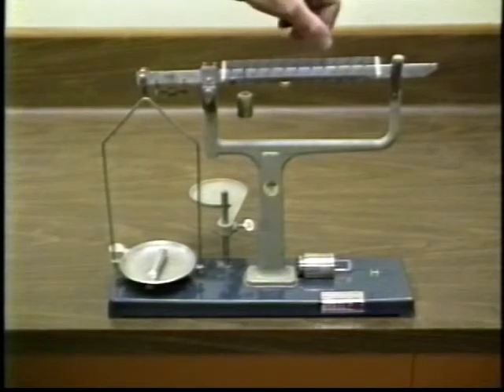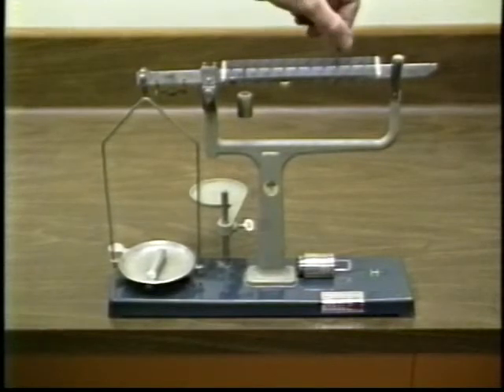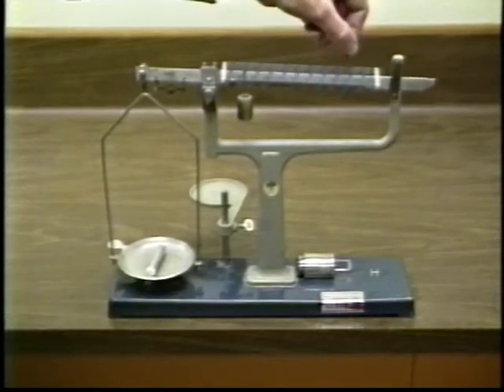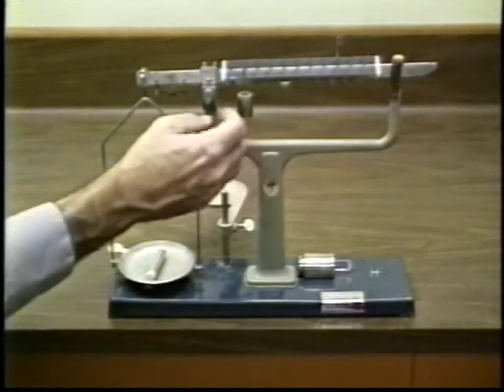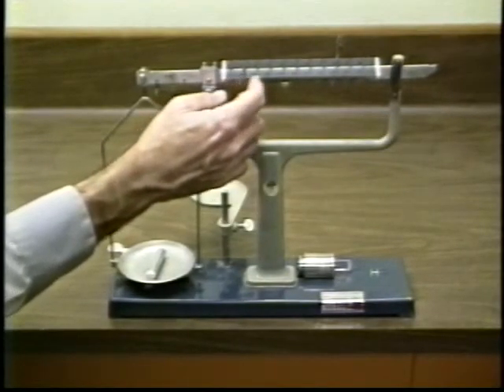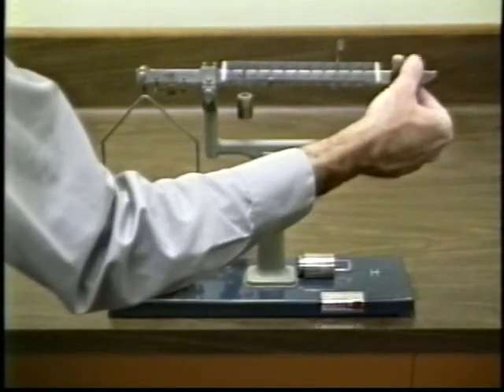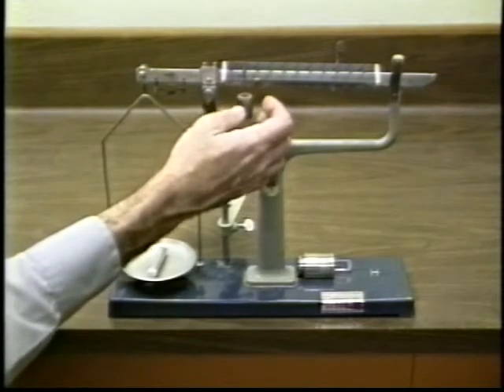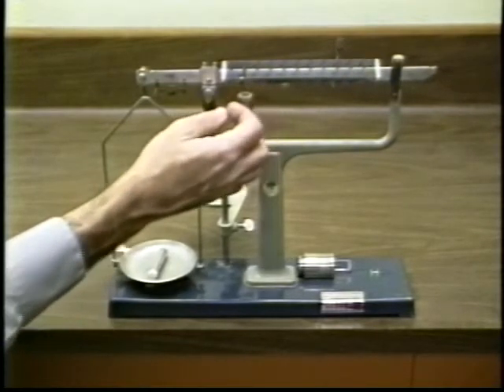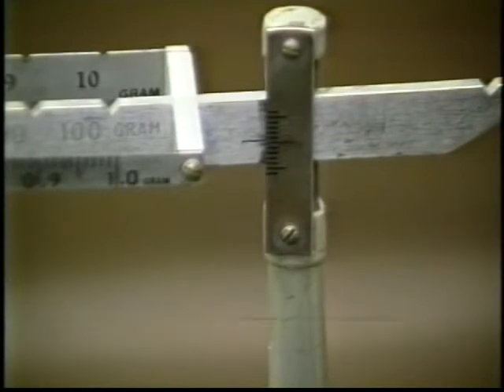Then move the next heavier slider as far to the right as possible without causing the right end of the beam to drop. Make sure the beam is not rubbing on the support. Using a finger or the tip of a pen or pencil, carefully slide the smallest sliding mass back and forth until it balances. It balances when the line on the beam lines up with the center line on the support.